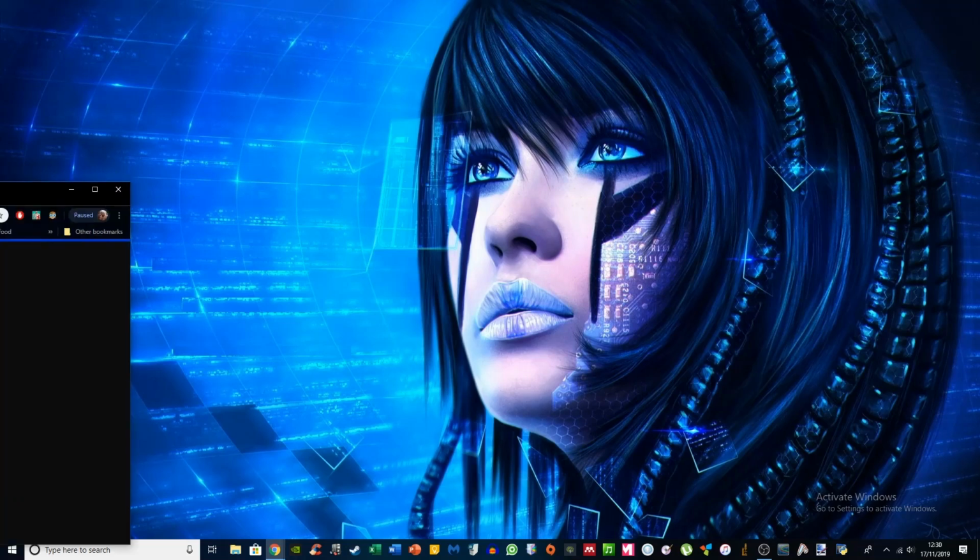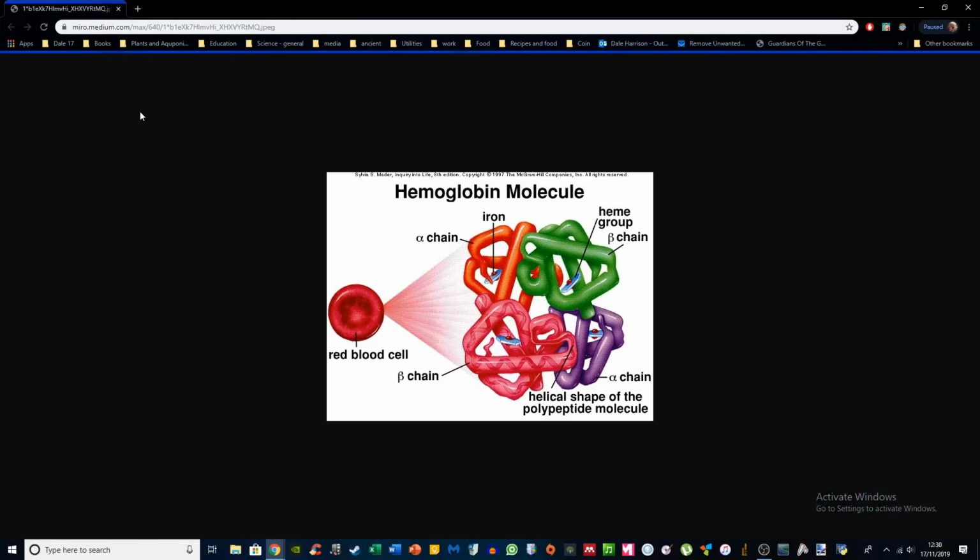With sickle cell anemia, we'll give a little bit of background, and as I say, I don't want to go too much into the theory and the background. You can find that in textbooks, other websites, plenty of other people on YouTube doing videos like these, but I just want to really get into the actual application of restriction digests and how we can use them to diagnose a mutation. But we'll give a bit of background first.